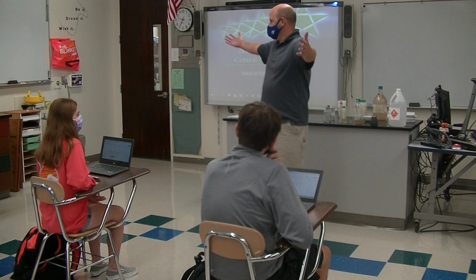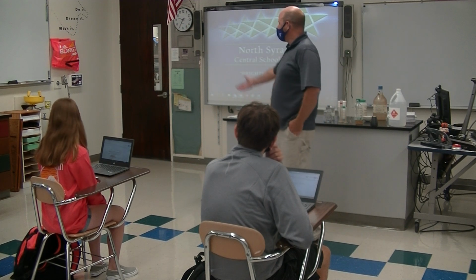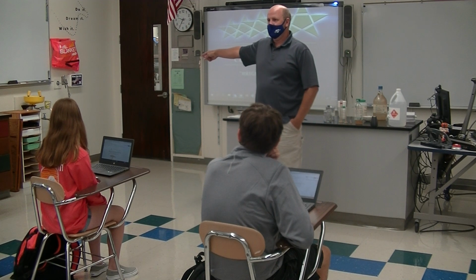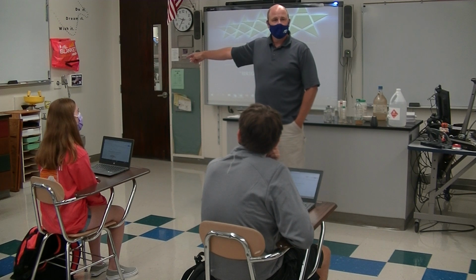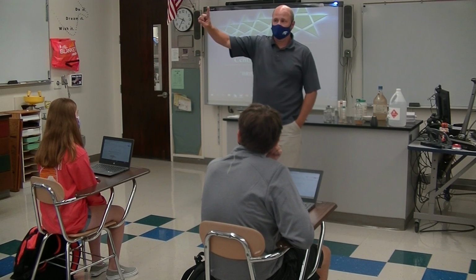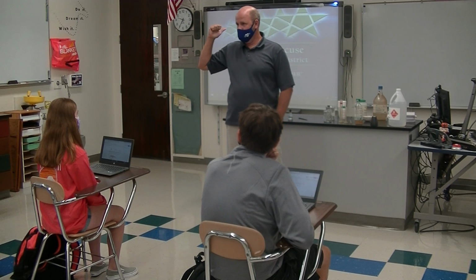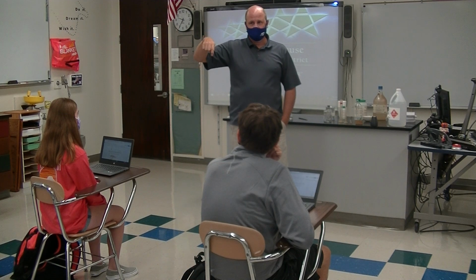Looking around the room, you can't leave the room. Yeah. Use the hose. That's not a hose, that's a shower. That's our shower. But you do. If you're in here and it gets on your clothes and it's enough to absorb into your clothes, the first thing that has to happen is the clothes have to come off. Well, probably the first thing that has to happen is whoever else is in the room is out. If it's a guy, I'm staying. If it's a girl, I'm going to get Miss Phelps, who's next door.